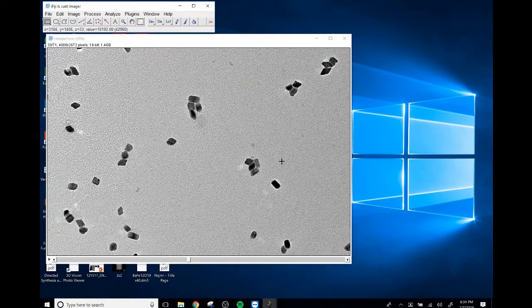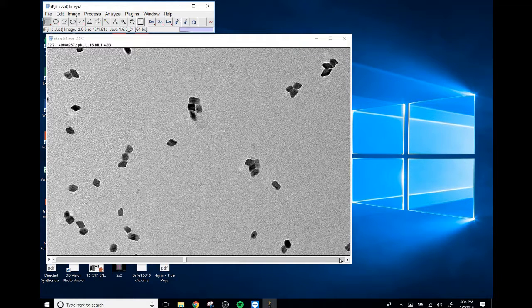So we're not going to save the transformation file, not for this kind of treatment, and we're going to press OK. Now you'll notice that I started this registration in the middle of the stack. The reason that I did this is because this takes a long time, and it'll go through slice by slice. With a file this big, it takes some time.